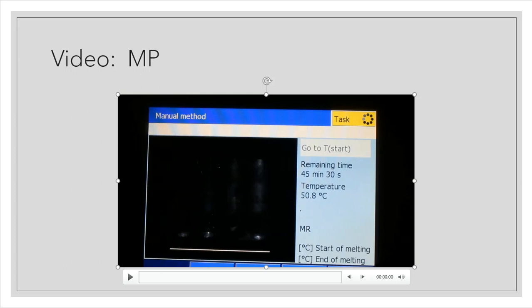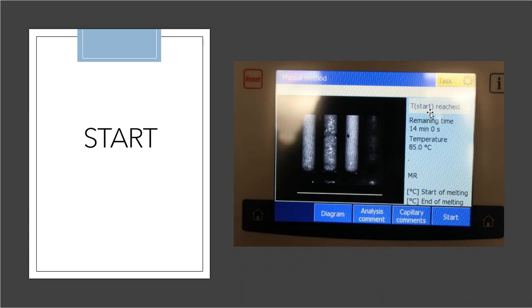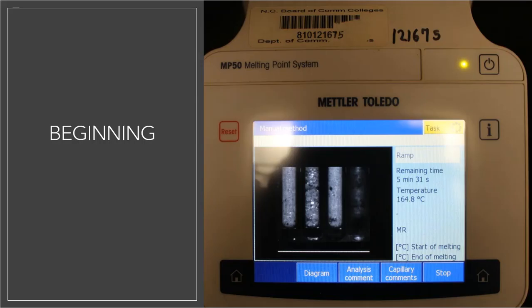Okay, so that's how we load up our samples into the Melting Point 50 or Mettler-Toledo MP50 system. This was at the beginning of the process. Notice this started at 85 degrees right there on the screen. So all three of these are solids, and you can clearly see that they are solids in the viewfinder. In the beginning, it started to heat up, and right now we're at 165 degrees. And at 165, you're seeing that all three of these crystals are still crystals. They're still solid. So that means that their melting points are higher than 165 at least.